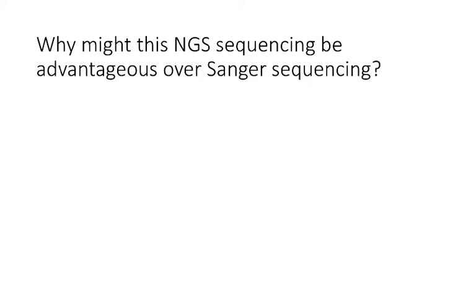So we've talked previously in this module about Sanger sequencing. What I want you to think about now is, why might this NGS or high throughput sequencing, remember, same thing, why might high throughput sequencing be better or more advantageous over Sanger sequencing?